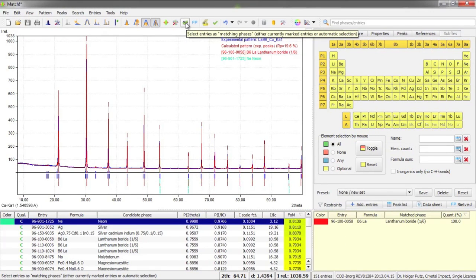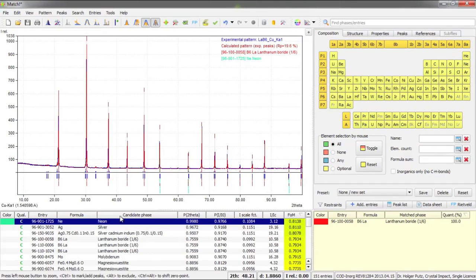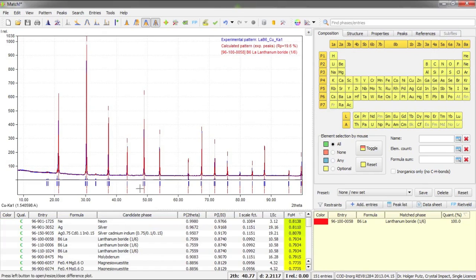Now MATCH tries to find the next matching phase but in this case it suggests neon, which is not very likely, so I just press escape and finish the phase identification.